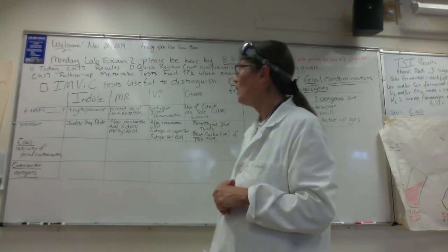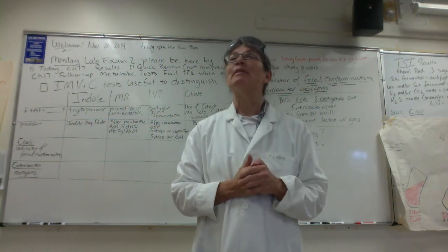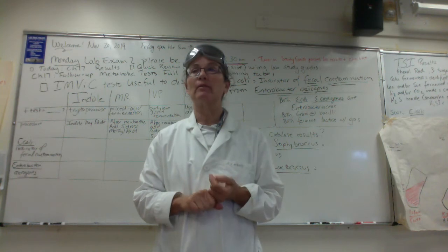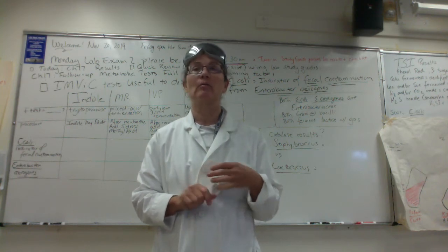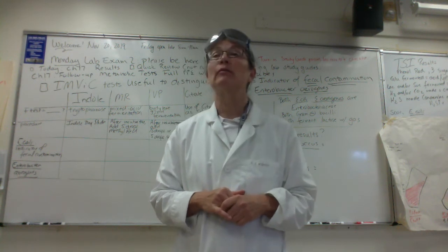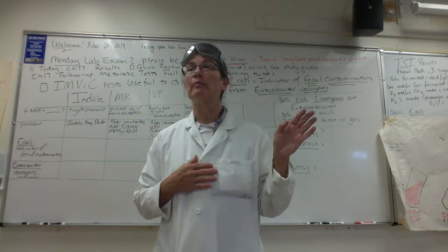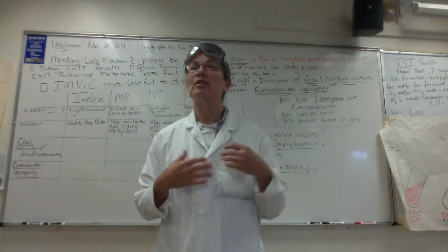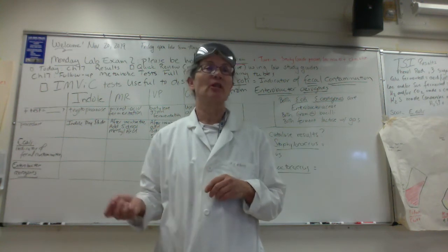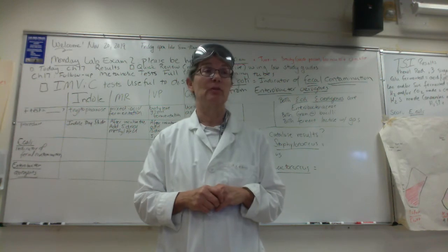Good. Folks, what does the M in IMViC stand for? Methyl red, good. And folks, if we have a positive methyl red test, what does it tell us about our microbe? Yeah, mixed acid fermentation, a very specific fermentation pathway. So you guys, you remember you inoculated MR broth, which is high glucose broth, right? So when you pull it out of the incubator, are you just going to look at it and determine if it's positive or negative? No, what do you have to do?